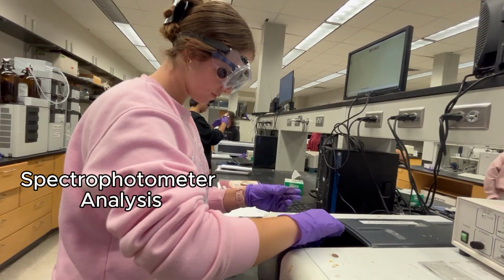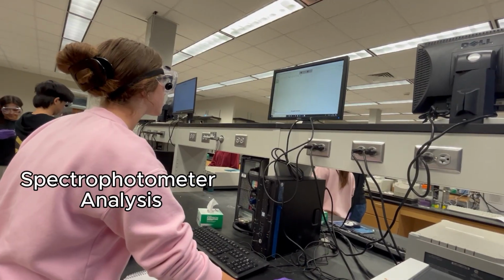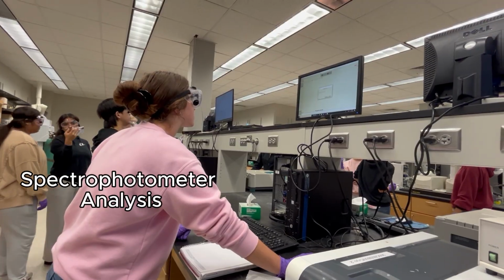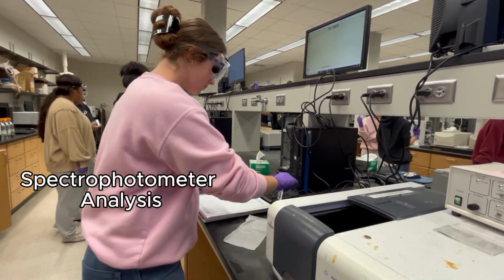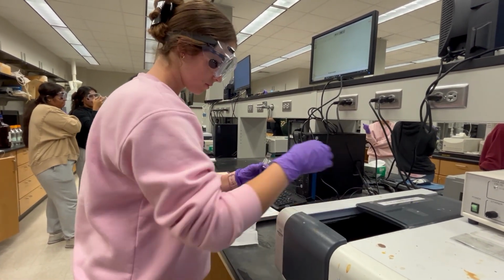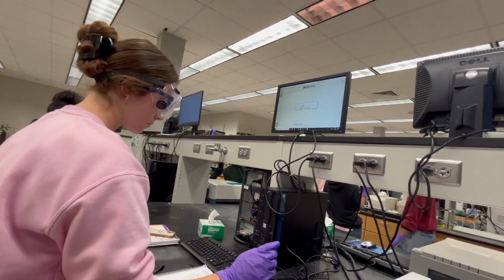We clean both sides of the cuvette, place it into the machine, and close the slide door. After that, we have to make sure we zero our machine and set it up from 200 nanometers to 800 nanometers on our wavelength. After we finish zeroing, we take our cuvette out of the machine, and we have to clean our dye number 1 before placing it into the machine. Once placed in the machine, we scan across the wavelengths.